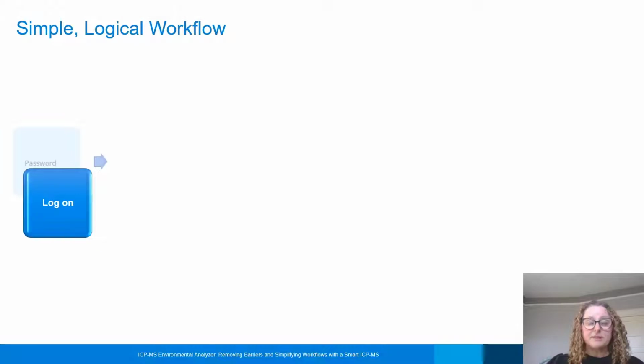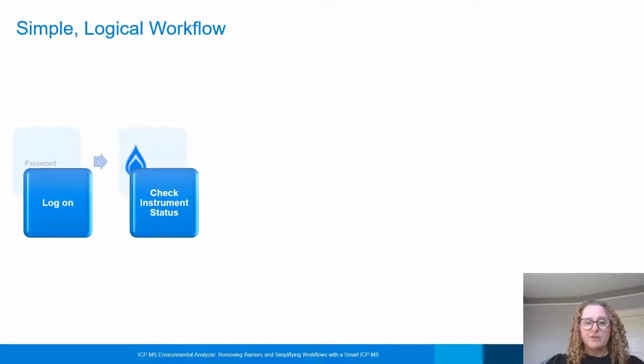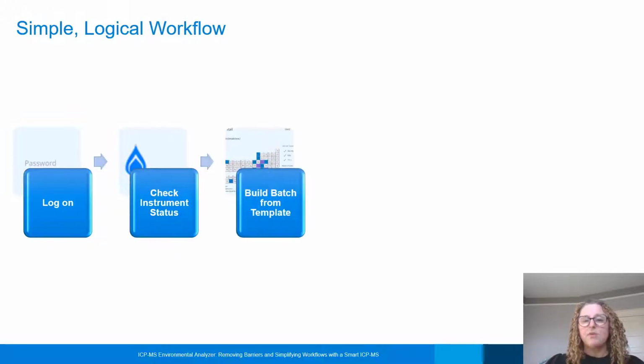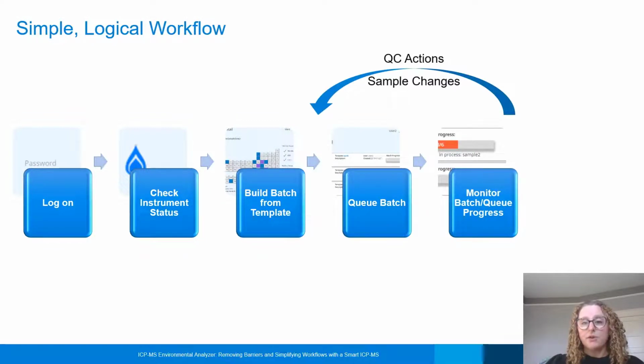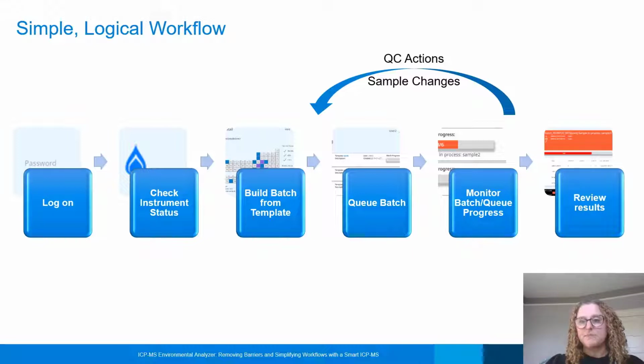So it's very simple and has a logical workflow. First you log on with your password. You can then check your instrument status. You can build batches from your template. You can put things in the queue. You can monitor your batch or your queue process, as well as your QC actions and make sample changes. And then at the end, you can even review your results.